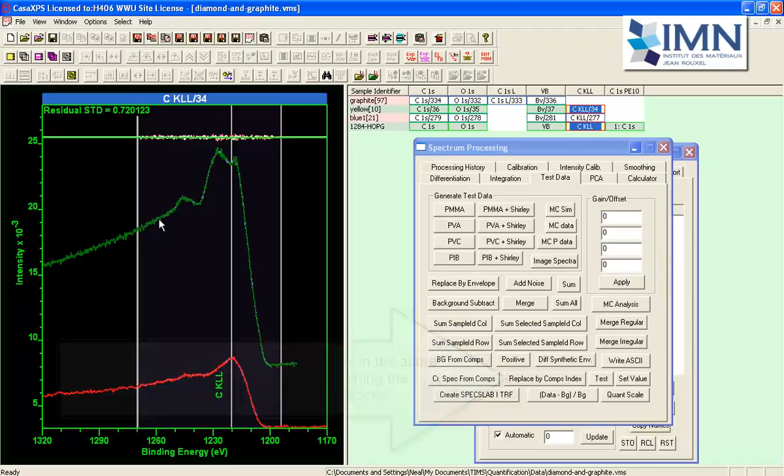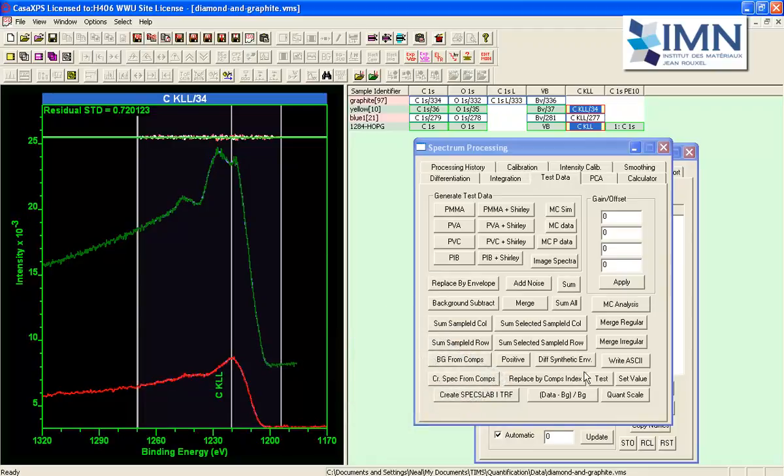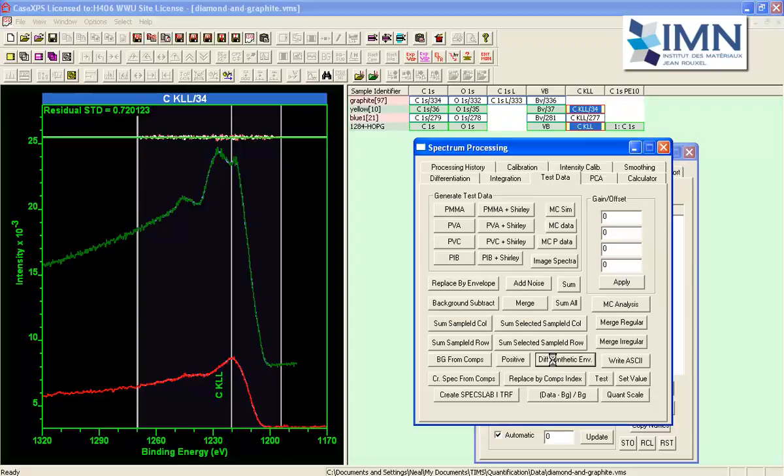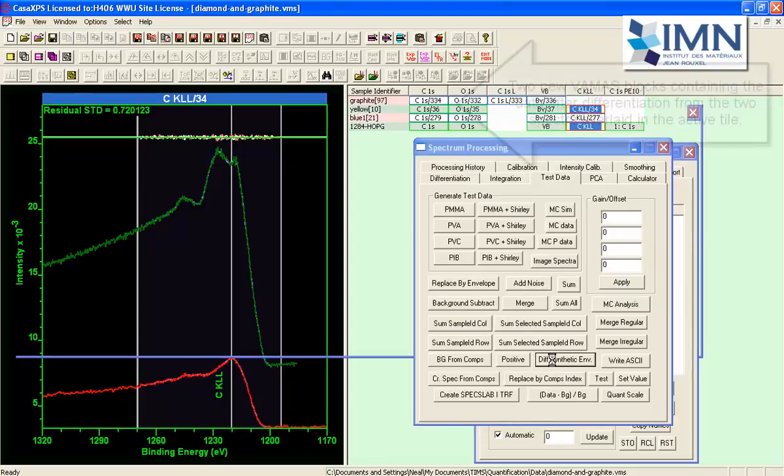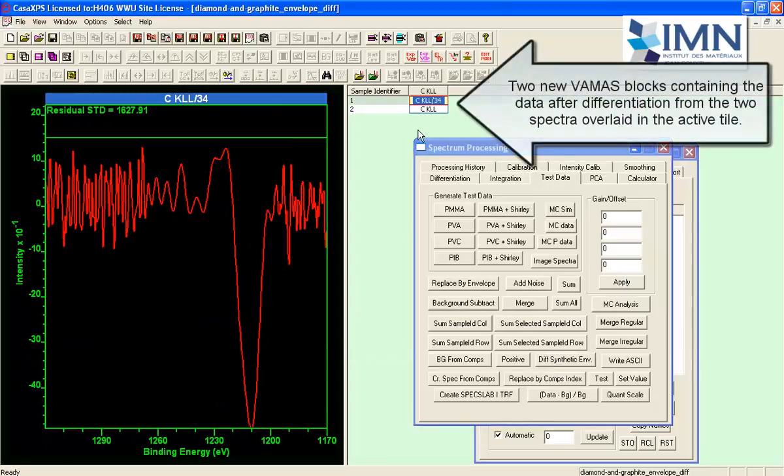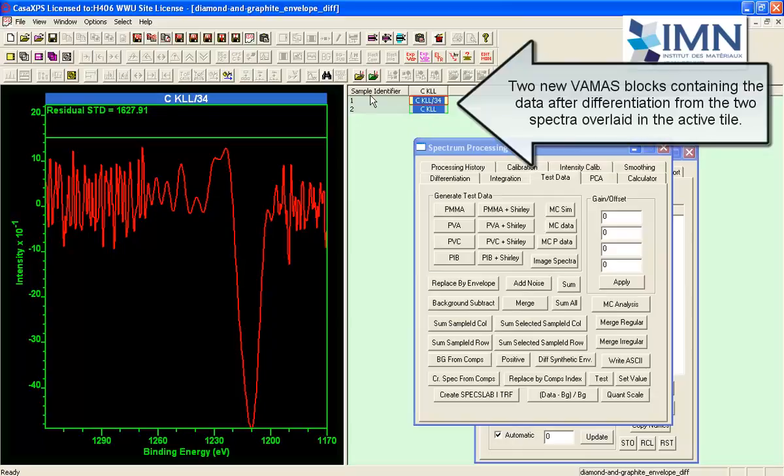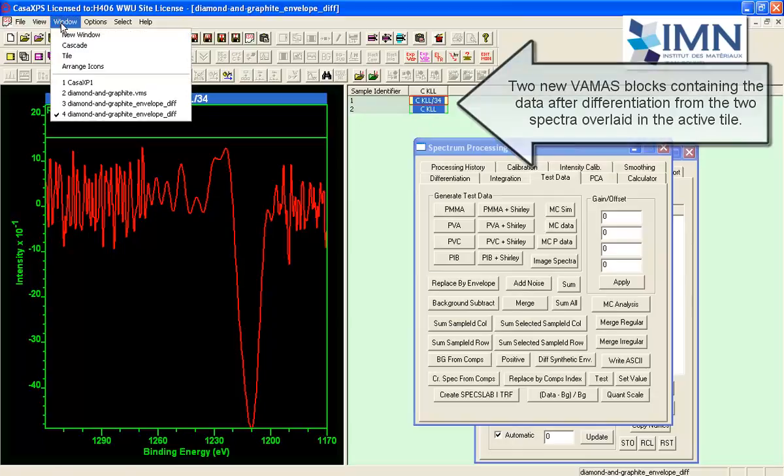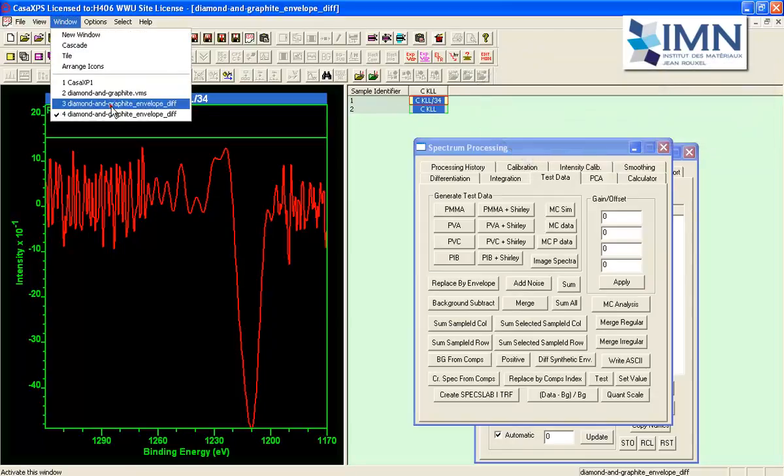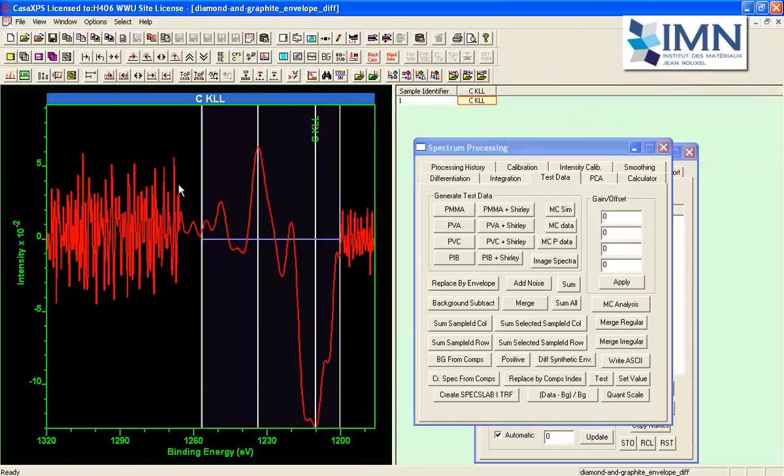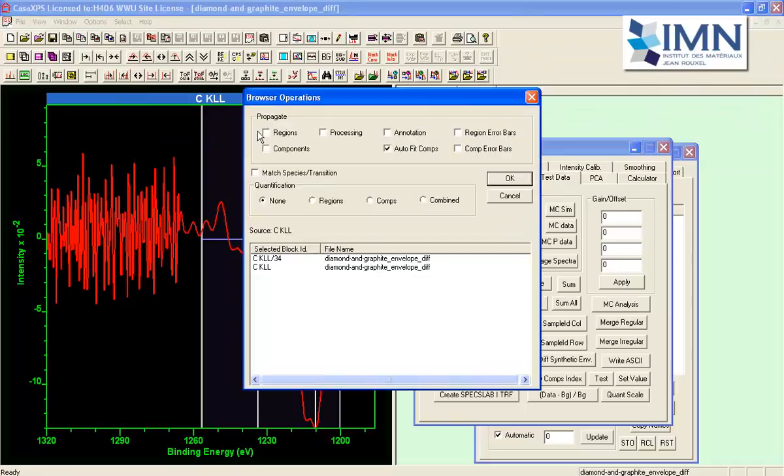That has been calculated from this polynomial and when I say differentiate the synthetic envelope I'll now get two VAMAS plots one for each overlaid in the active tile let me go back here and I'll just propagate the region that I previously used for the SP background type.